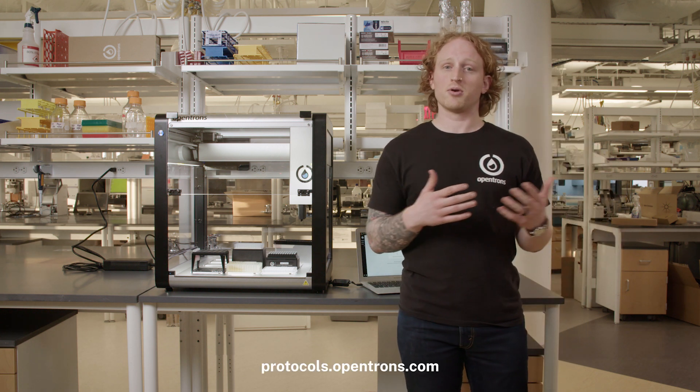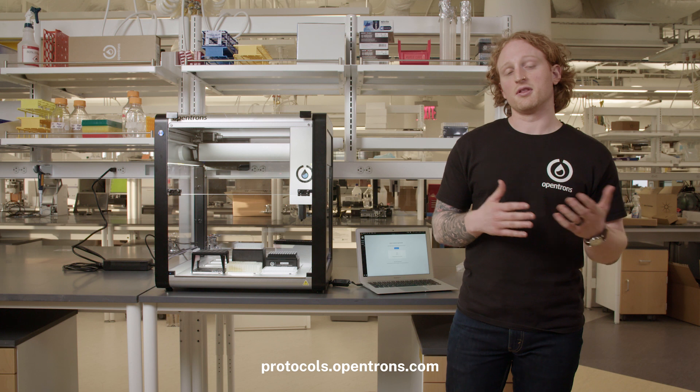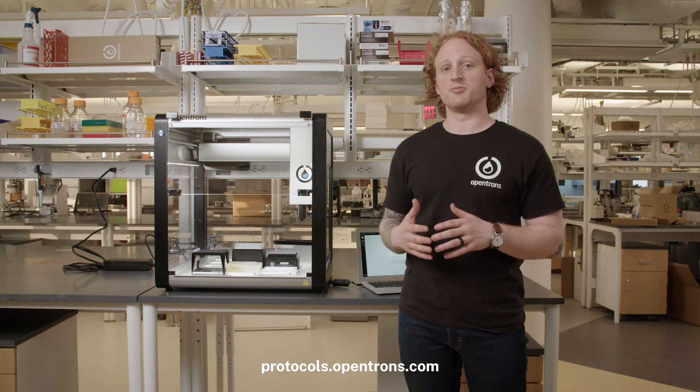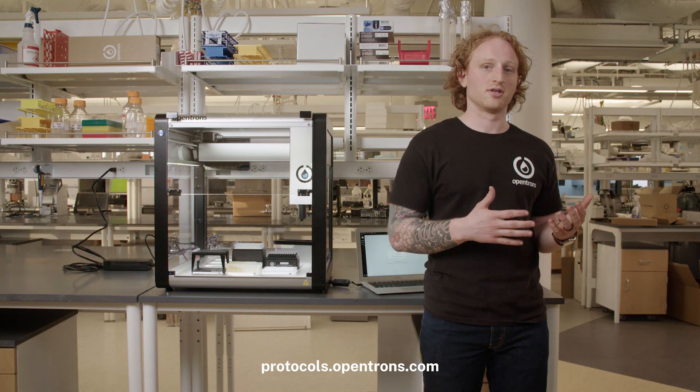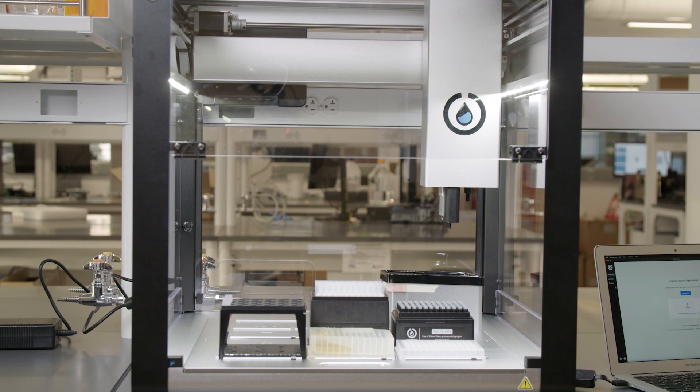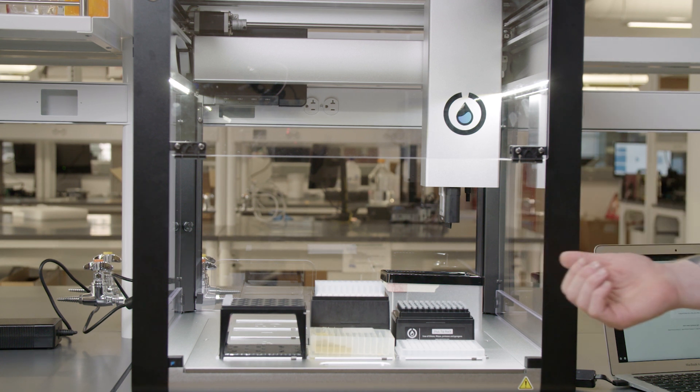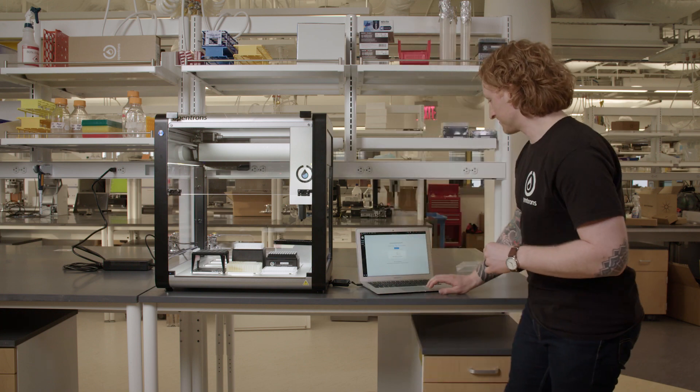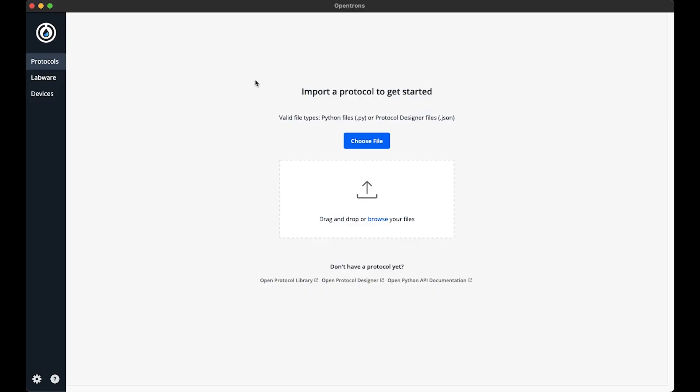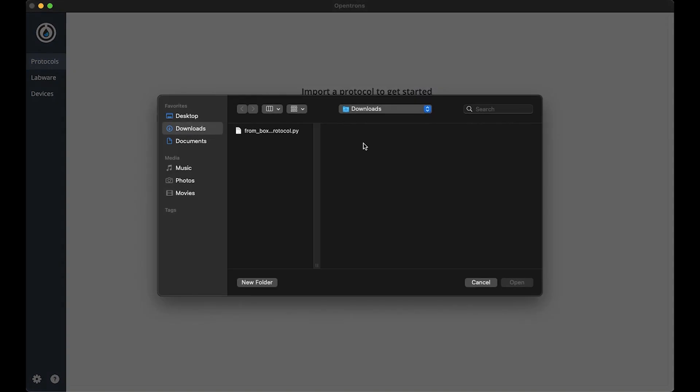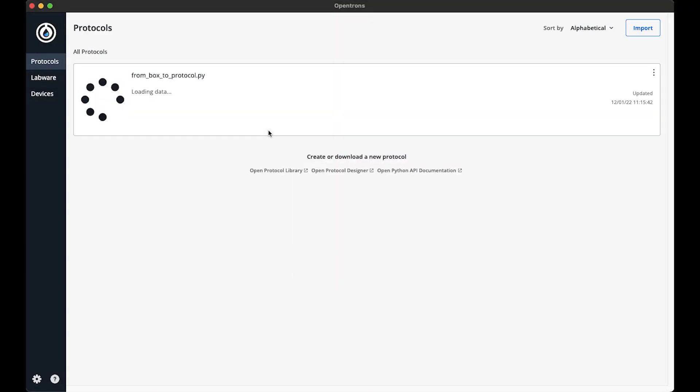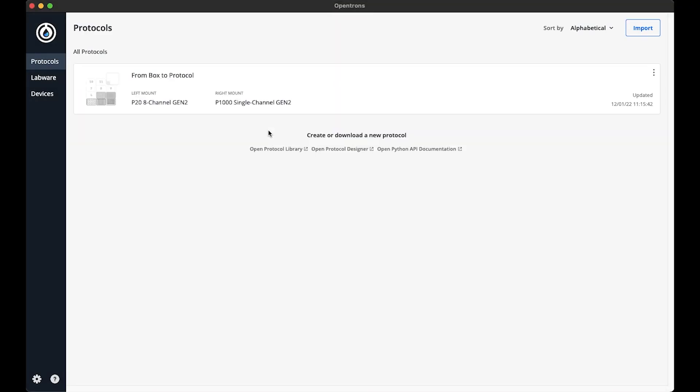It can be found in our protocol library. The link to the protocol will be in the video description. It's a simple protocol that aspirates liquid from a tube rack or reservoir into the well plate. To import a protocol, I'm going to go to the Opentrons app, navigate to the protocols tab. This will bring me to the protocol import page. I can either drag and drop a file to the app or choose the file. I'm going to select to choose the file option. A file browser will pop up and I will be able to select the protocol I downloaded. When I import a protocol, the app will run it through the protocol analysis, which is a local simulation of the protocol to grab specific information regarding the metadata and the deck map of the protocol.